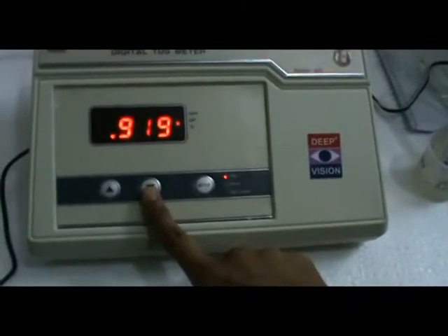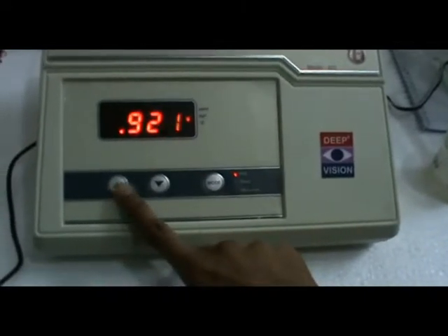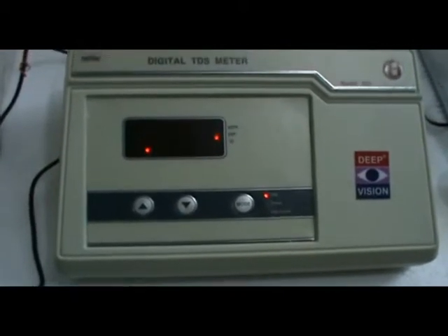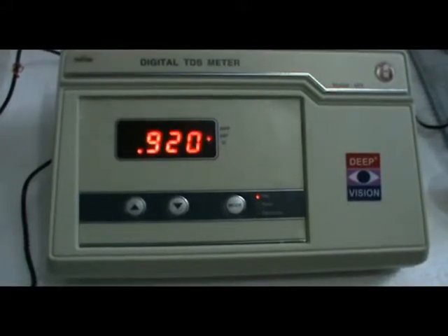Use the increase or decrease key. The display will flash to set the value. Wait for 5 to 6 seconds and then it is automatically calibrated.